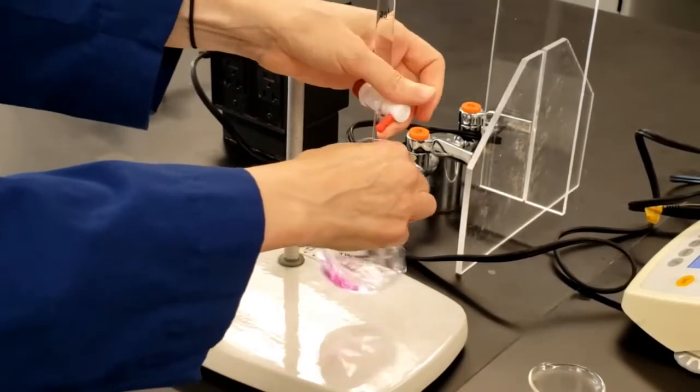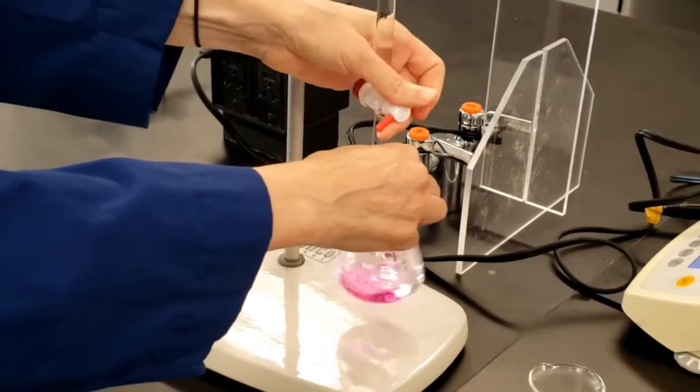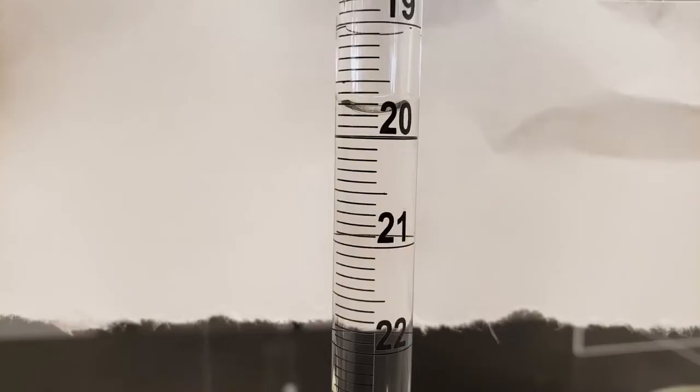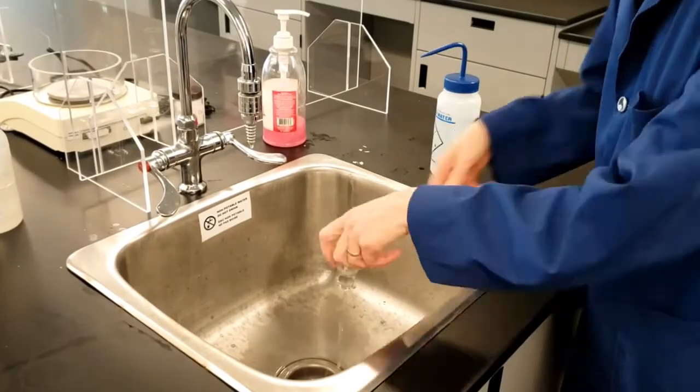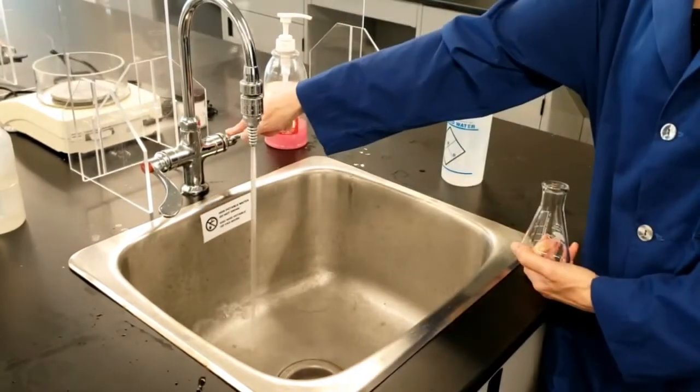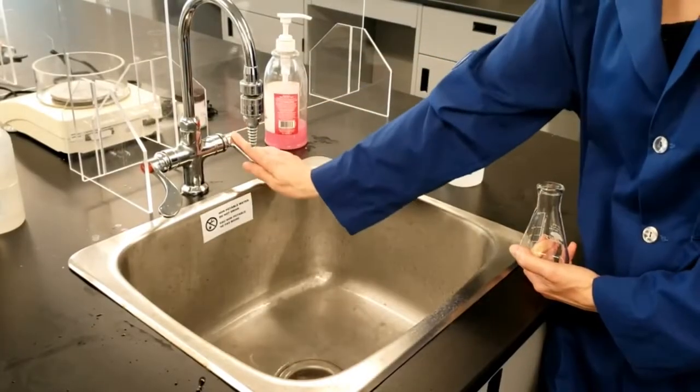Taking note of the initial and final volume readings of the burette will allow you to calculate the approximate volume of titrant needed. Empty your sample into the sink and rinse your Erlenmeyer flask 3 times with deionized water. Rinse the sink well with tap water. Dry the outside of the flask and repeat steps 3 to 5 in order to prepare for your precise titration.